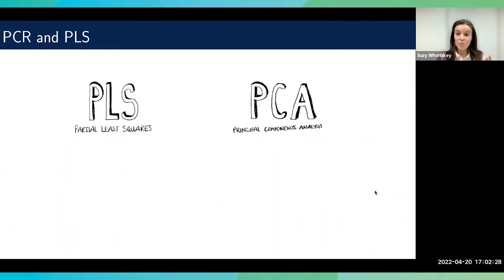In an ideal world, we would want elements of both of these models to give us a really good predictive model that uses information from the response, but gives us this underlying probability distribution that the principal component analysis, our principal component regression model, has available to us. So we propose to use reordered probabilistic principal component regression, where we reorder the principal components based on the strength of the relationship with the response variable, and we exploit that probabilistic model underneath by sampling from the distribution of the scores rather than using the expected score that is usually done in PCR.